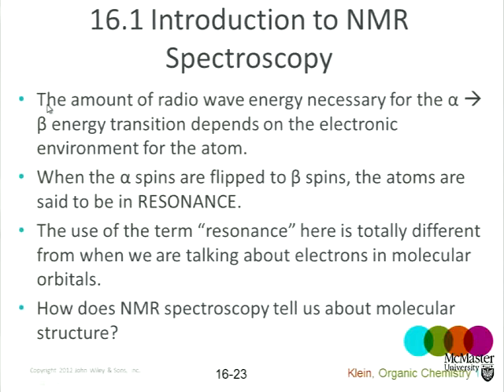So notice that the term resonance here, it's important to distinguish this particular type of resonance. It's resonance like a bridge shaking, right? You've mostly probably seen those pictures of bridges that go into resonance and they shake and vibrate and then eventually fall down, right? It's that type of resonance that we're talking about here, different from what we mean when we apply the term resonance to talking about electrons in molecular orbitals.